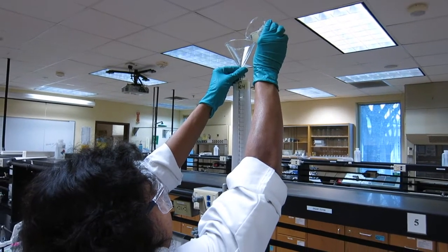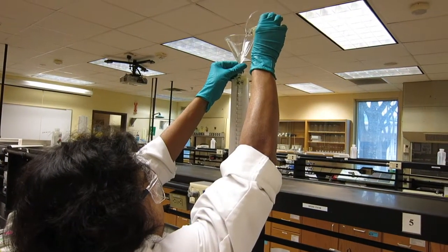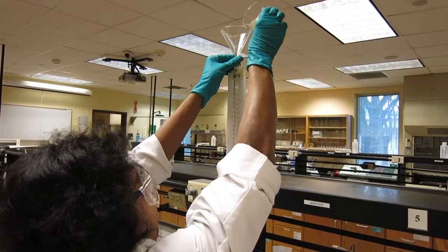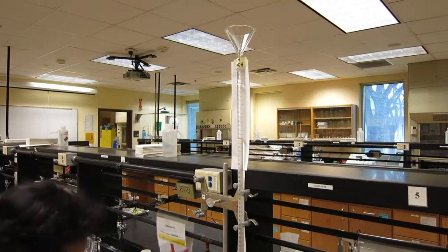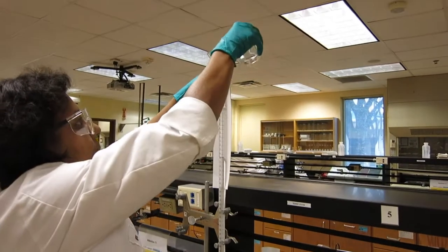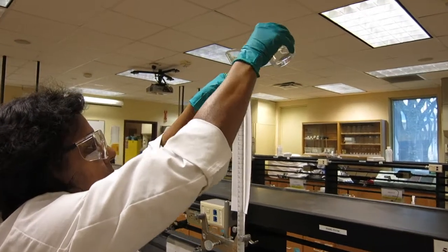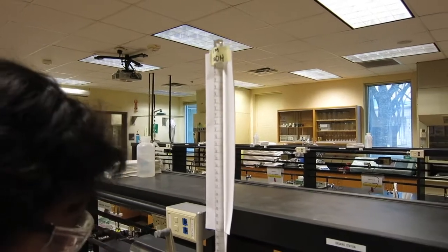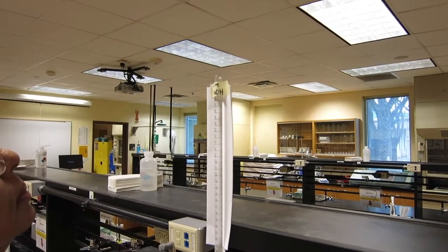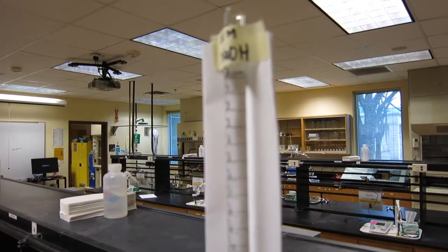We're putting the NaOH into the buret. Just fill it up. Try to hit zero. Now you're adjusting to make sure that it hits zero, so the meniscus rests at zero.